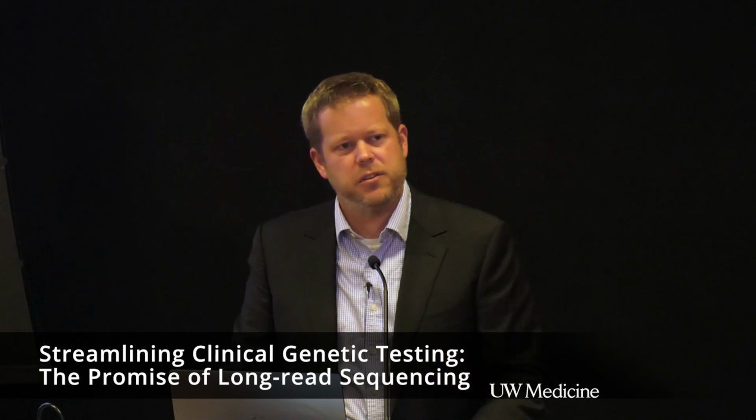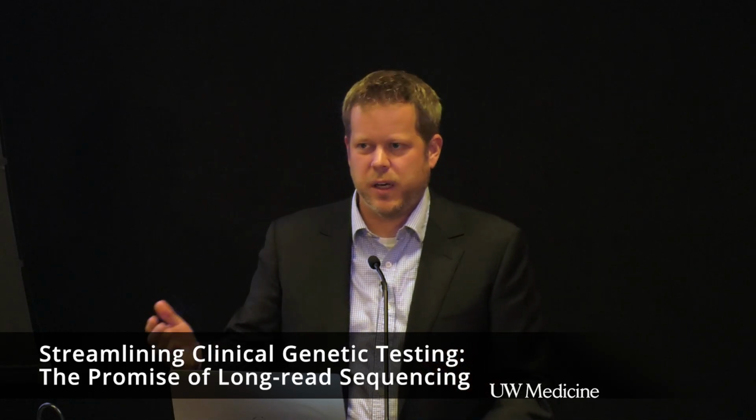Brian? Someone else on the line's asking, are there situations for which long-range sequencing will not work well and for which other sequencing approaches would be better? Yeah. Not counting cost, somatic mutations are difficult to detect because you need more coverage, right? And the error rate with nanopore. PacBio is going to be better at detecting those, but if you need 1000x coverage, long reads probably is not the right way to go until the cost comes way down. And then other cases, you spend so much time thinking about one thing, it's hard to see the disadvantages, but I guess somatic mosaicism is the biggest one that I think about for this.